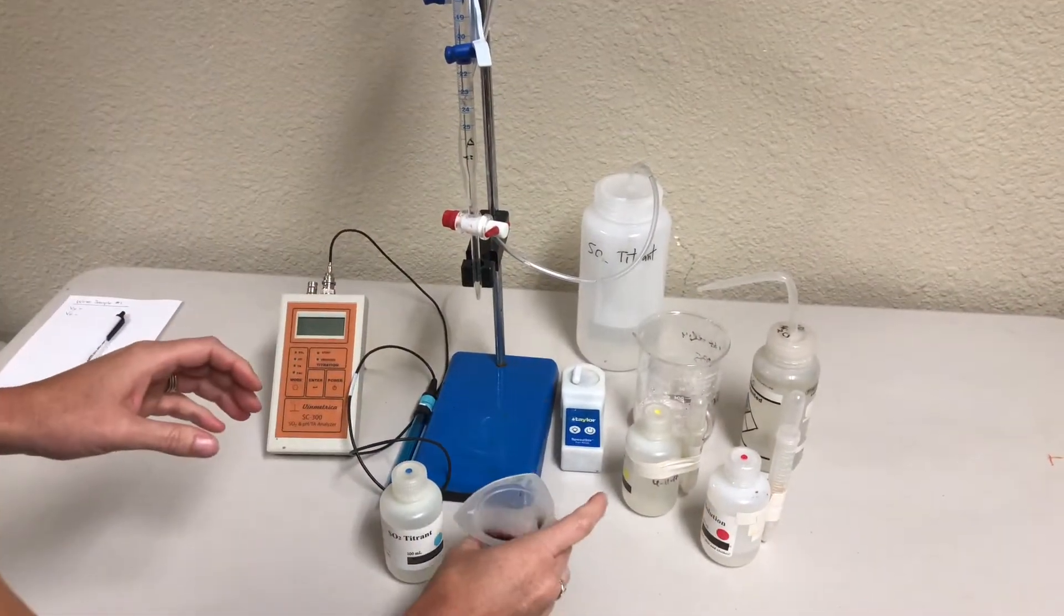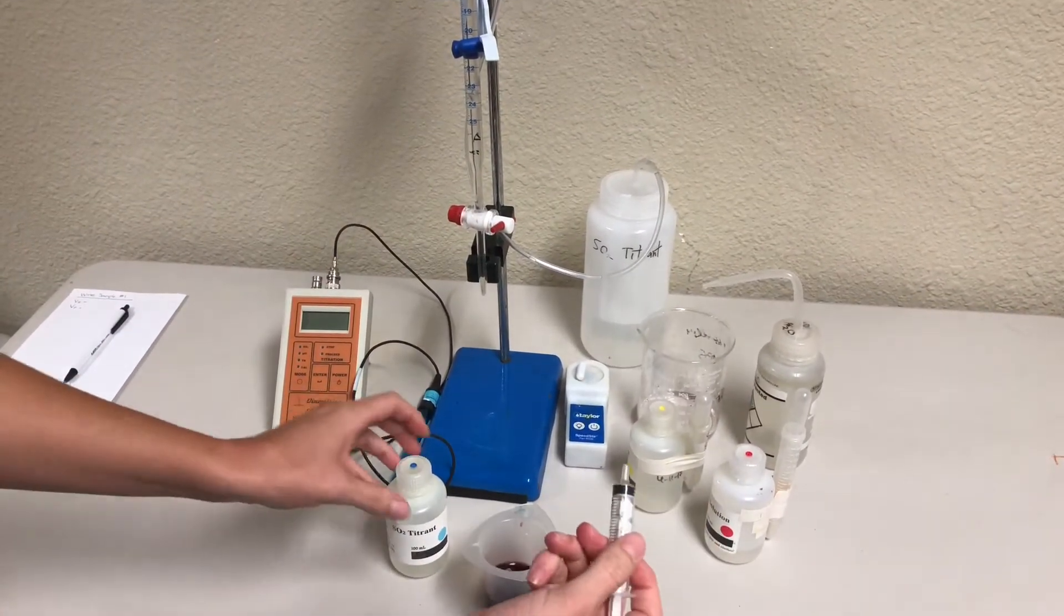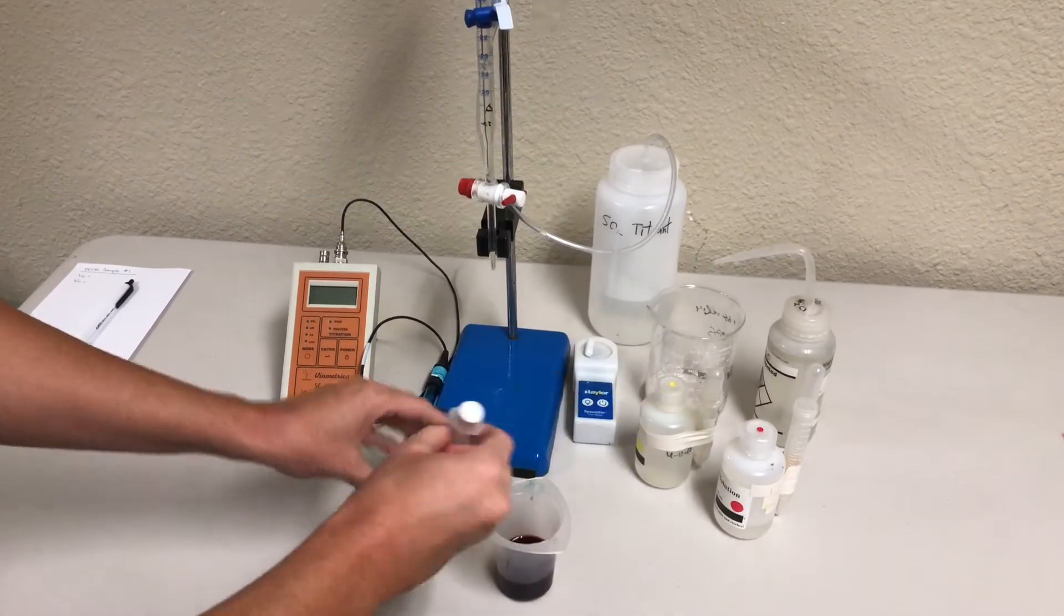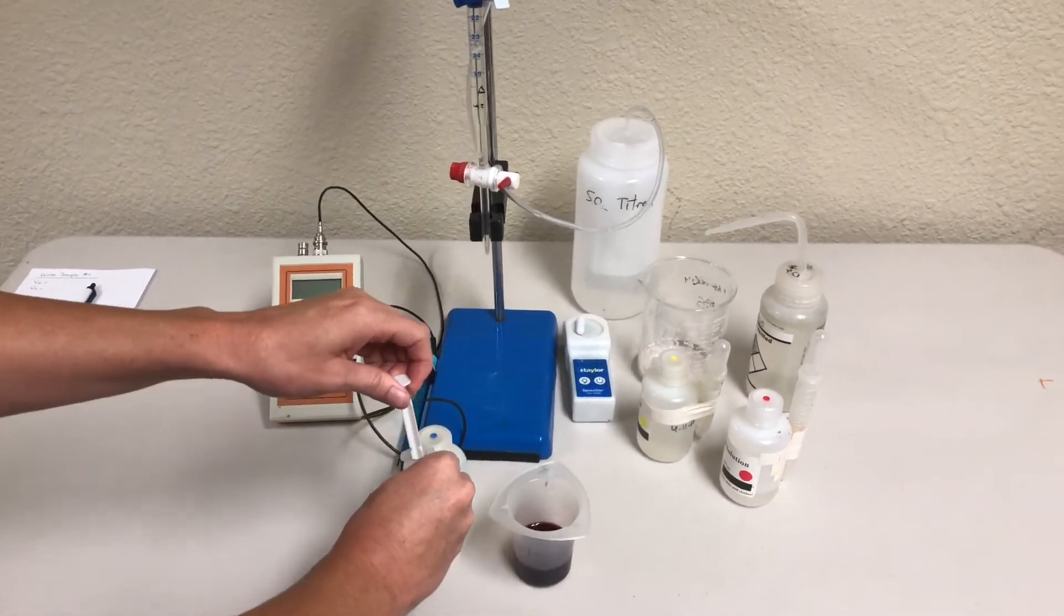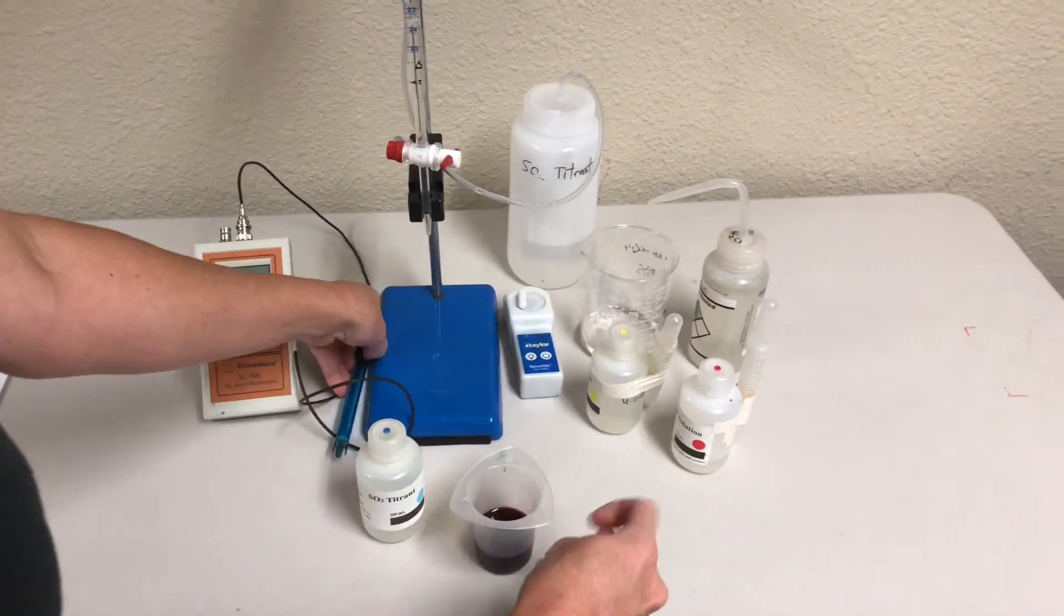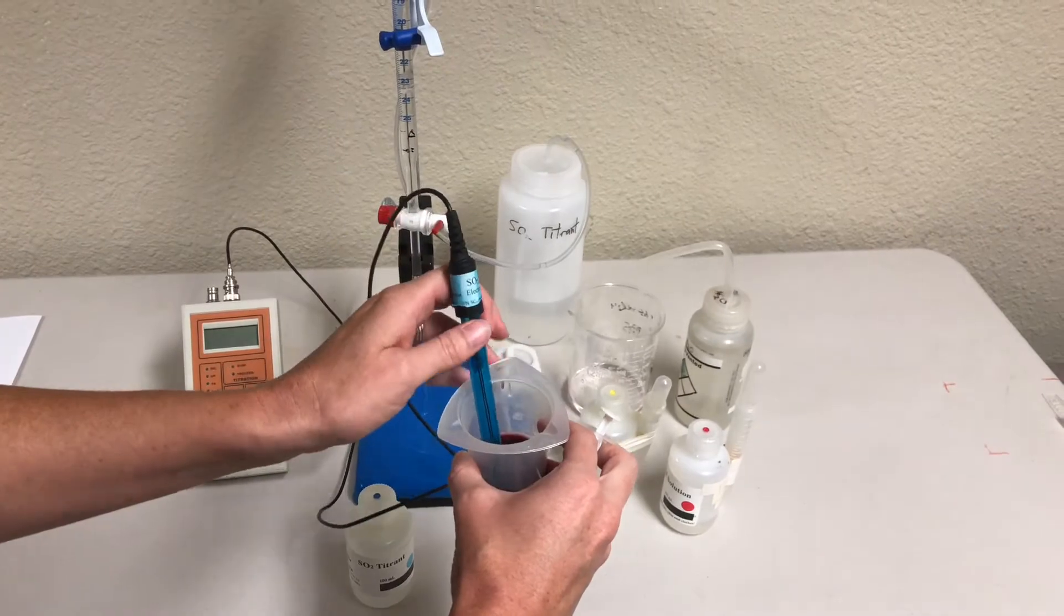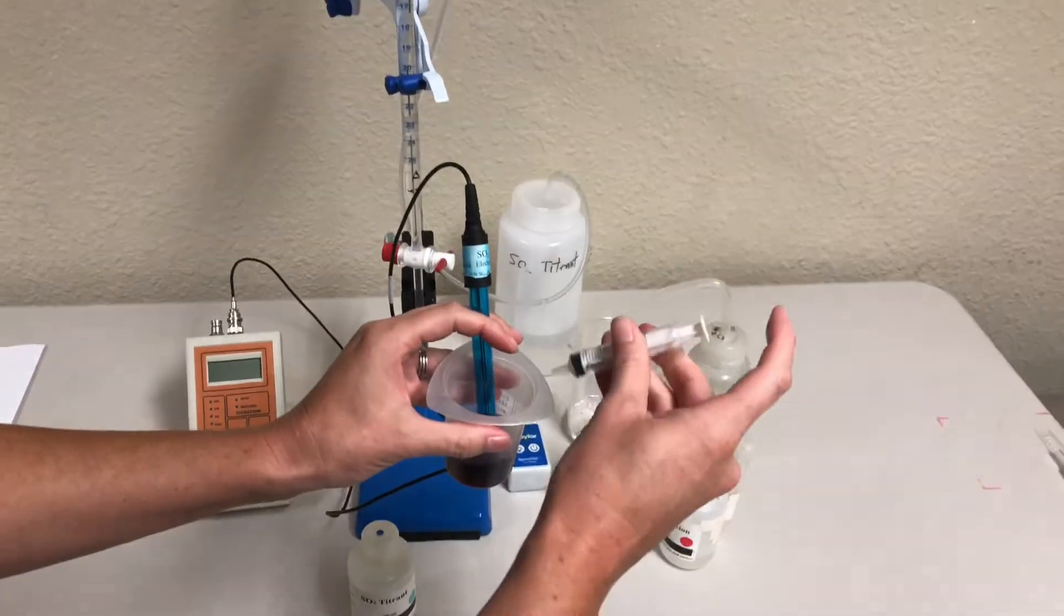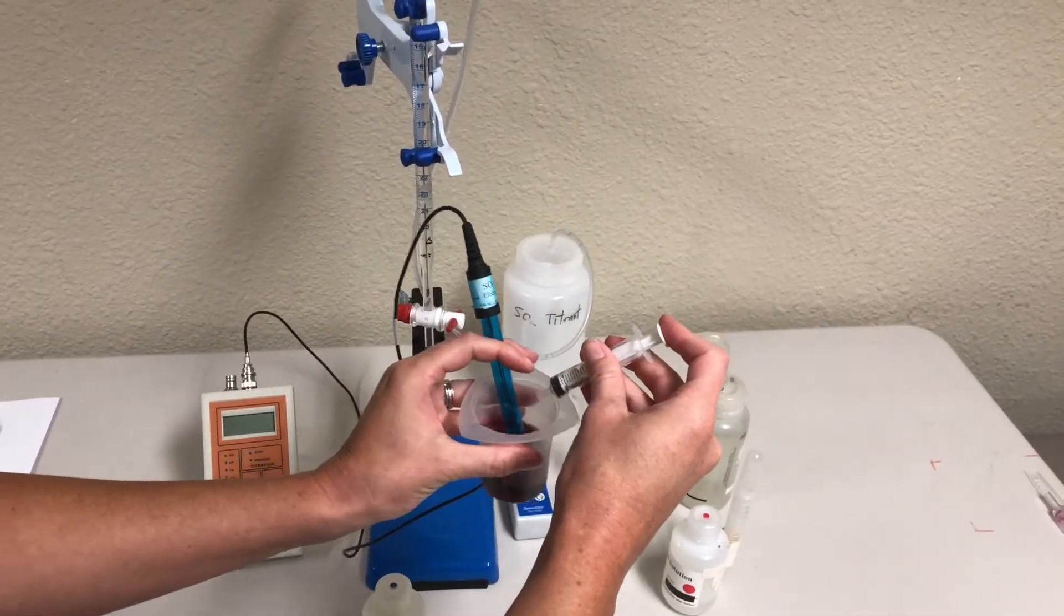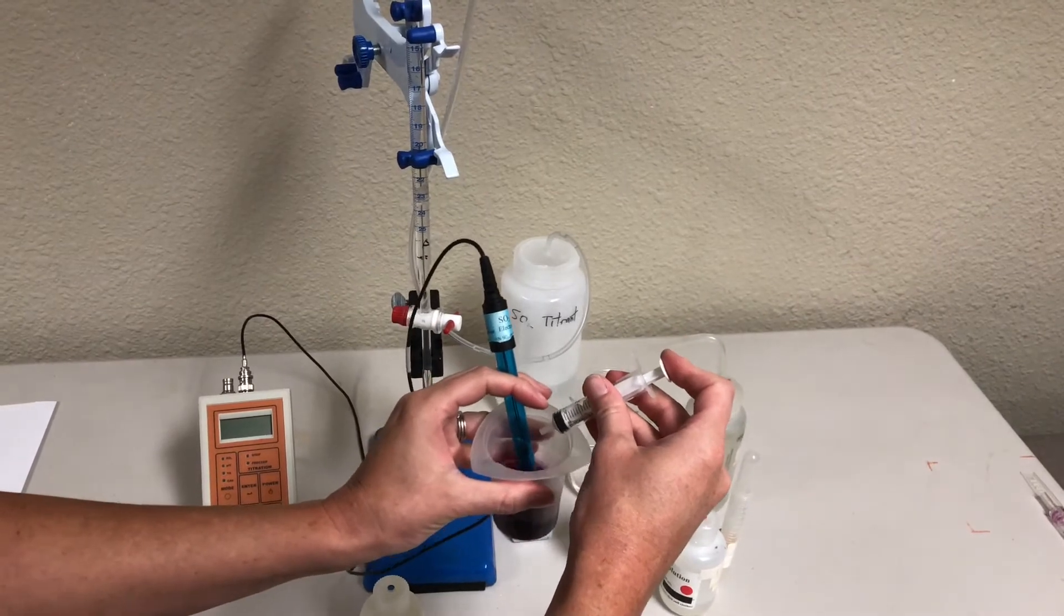Now, if you're using the syringe and your SO2 titrant, you'll use the syringe to suck up some SO2 titrant, and you'll run the test in your hand. You'll insert the SO2 electrode into your wine sample, and titrate using your syringe while constantly swirling the sample.